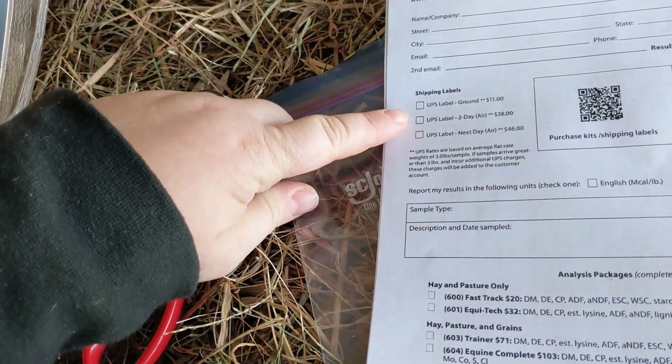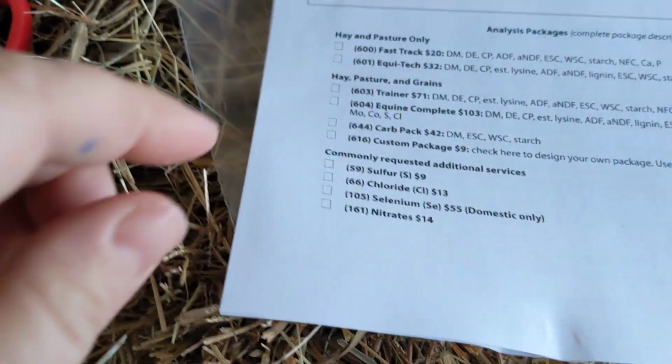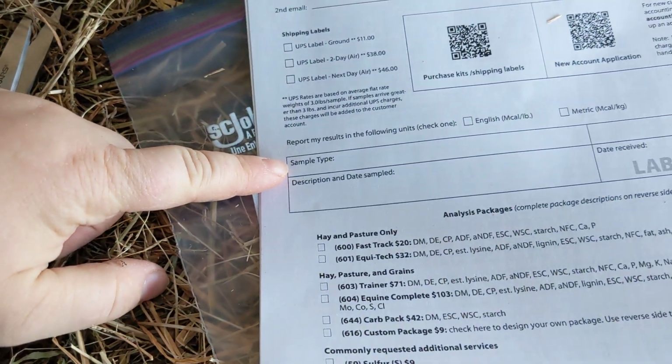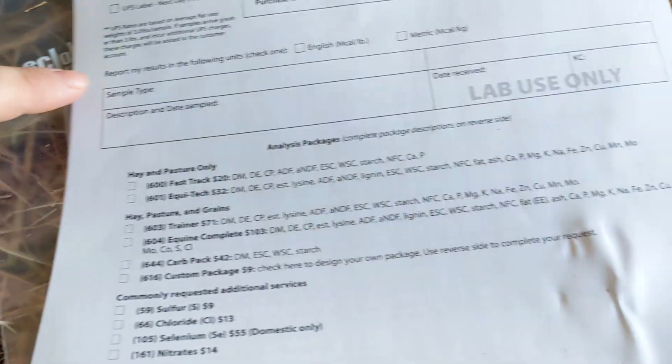I think they just send the results to your email. You don't need to do anything with this. Don't worry about that. That's if you buy a prepaid kit from them and stuff. For sample type, you're going to want to write hay. I think they also do forage and grain testing, but you're not doing that today.